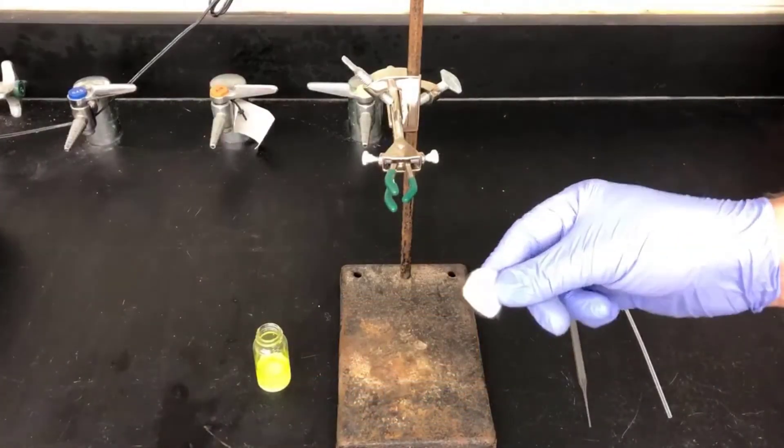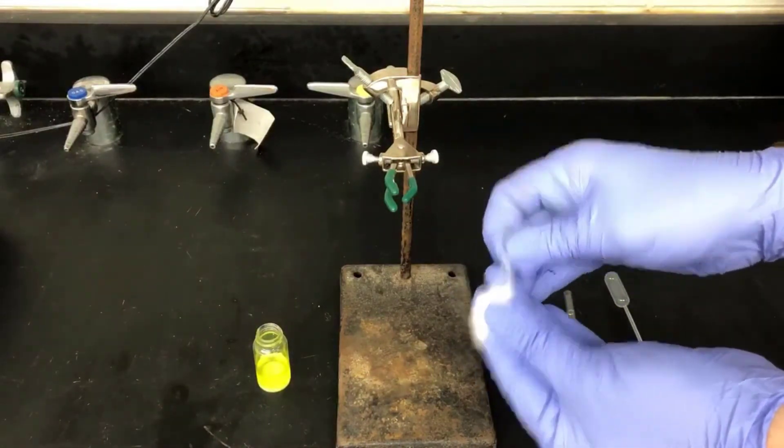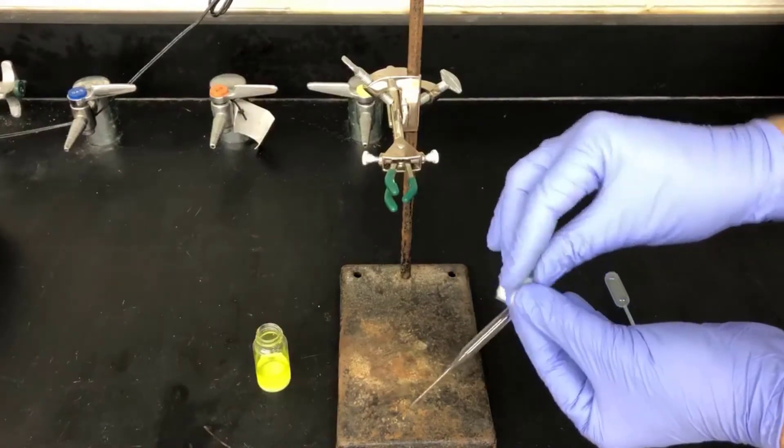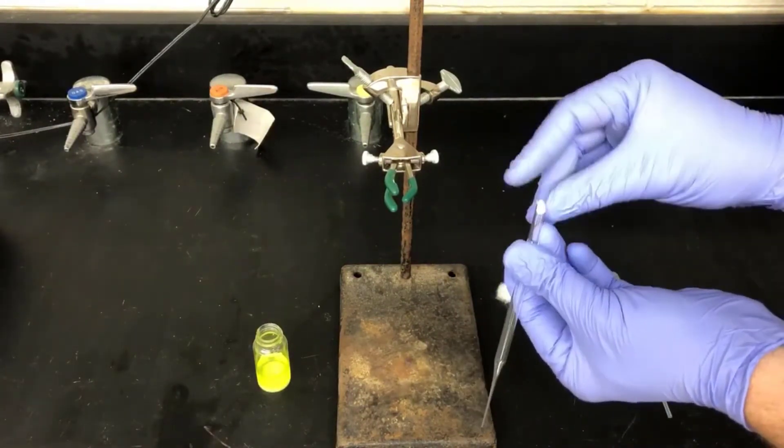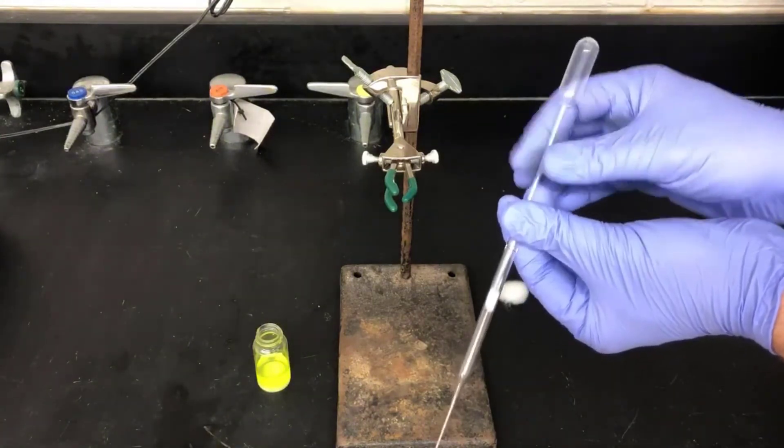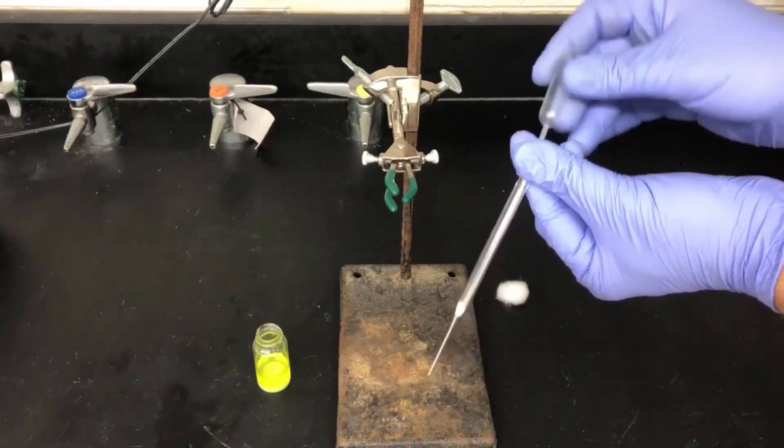Now I'll filter the citrus oil solution to remove the magnesium sulfate. I'm starting off with a tuft of cotton here from a standard cotton ball, and I will push that into the tip of a disposable glass pipette. This little tuft of cotton is going to serve as a filter to remove the solid magnesium sulfate particles from the solution.